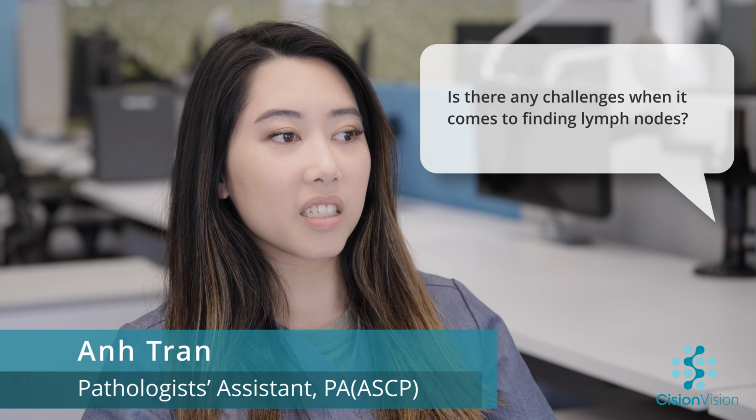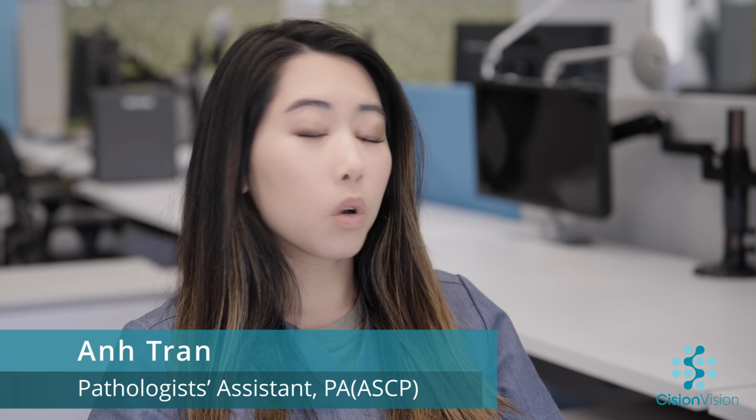There are a lot of challenges that can come with finding lymph nodes. The first, most basic challenge is finding enough lymph nodes, which can be compounded by a number of circumstances. For example, if you are a new PA student or a resident, the first few lymph node searches can be difficult. This is because lymph nodes can range in all sizes from 1 millimeter to positive lymph nodes being up to 10 centimeters. And in addition to that, they can range in different levels of firmness. Sometimes they can be easy to palpate, and sometimes they're very difficult to palpate.